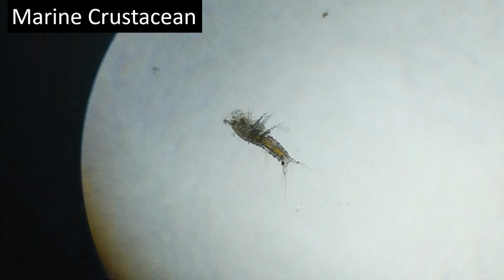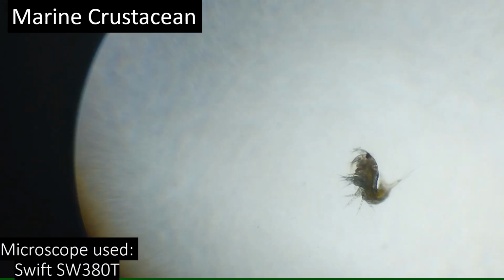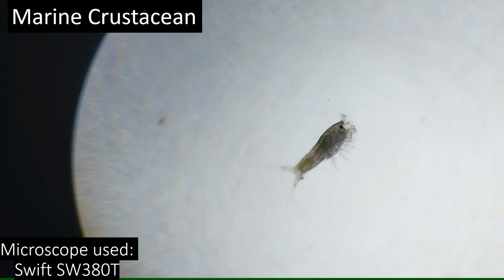Here is how some crustaceans look when filmed through a phone camera. Here is what they look like under the microscope. My guess is that these are copepods. However, they don't look like the copepod shown earlier. This could be because they are a different type or they are in a different stage of their life cycle.